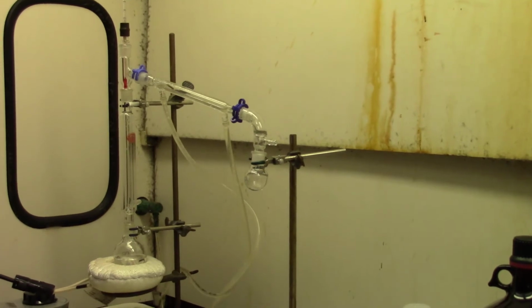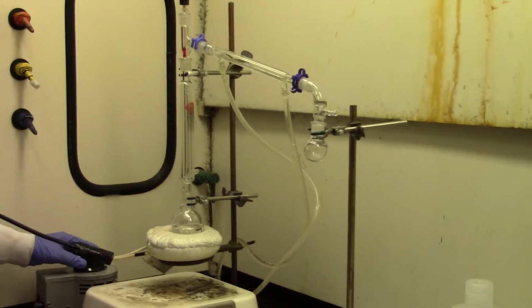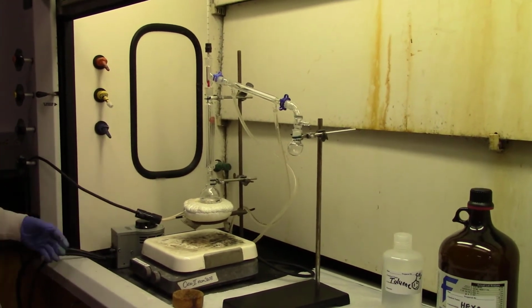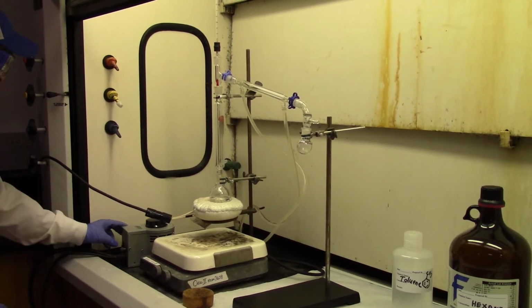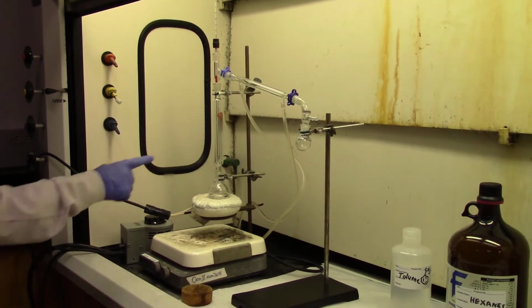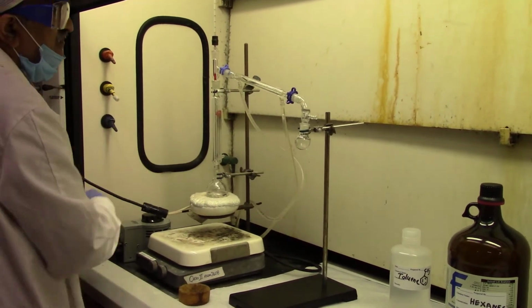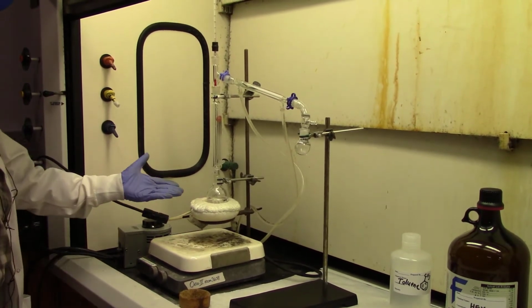We have already charged it with the 1-to-1 mixture of hexane and toluene. Now we are going to heat it. Make sure that the setting is around 80. An 80 setting is appropriate to boil the first component, which is hexane. Hexane should boil around 69 degrees, at least that's the hope.